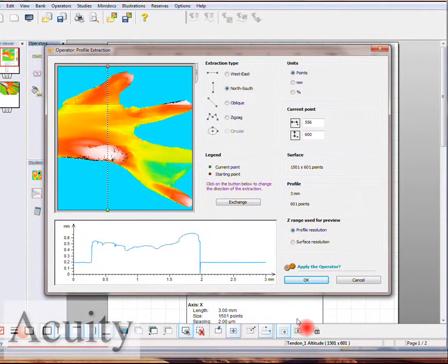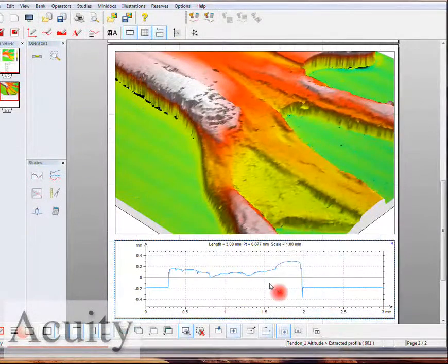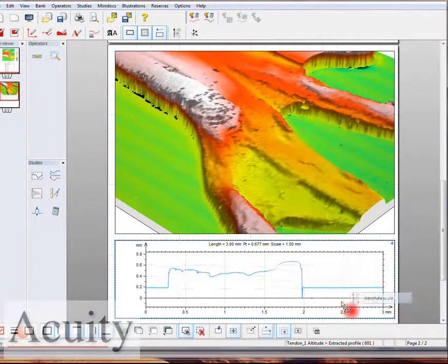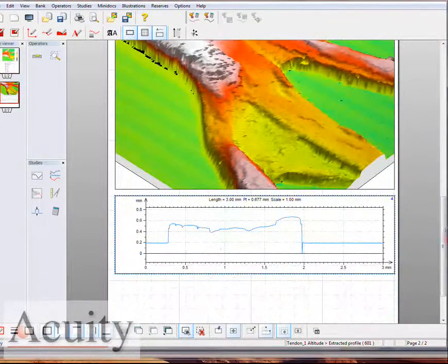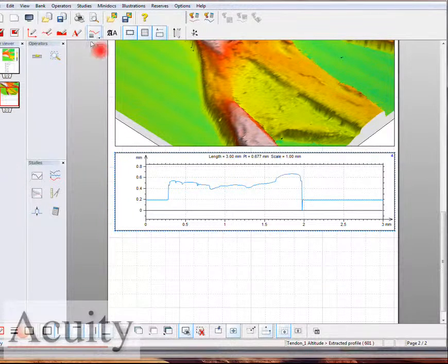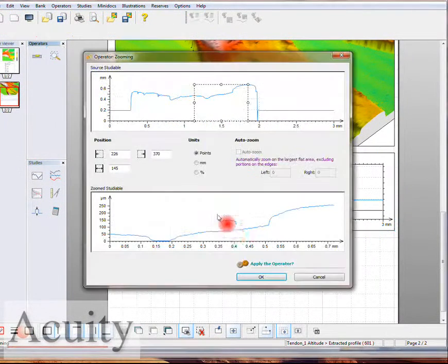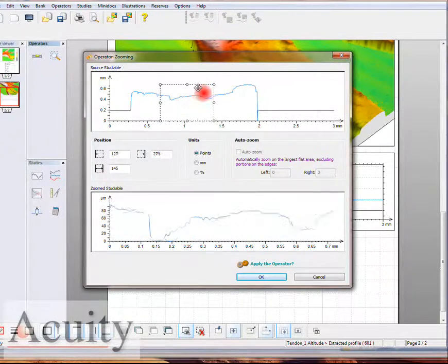In the X we're going to have more data, but let's go ahead and start with the Y. Here you can see that we're going across these points from north to south. You can see very good data. There are no spurious points, looks very clean. We can come up in here to give you a better idea and we can zoom that up over some of these features.